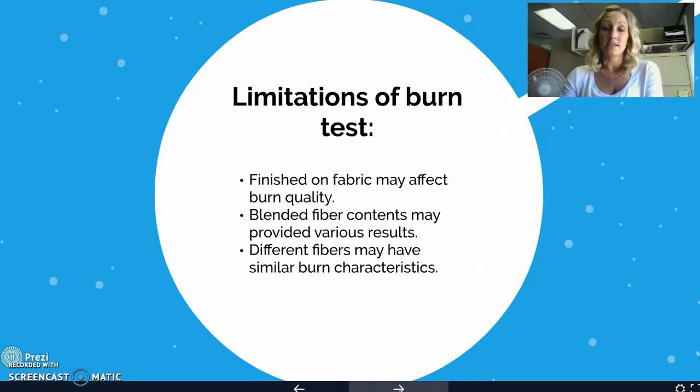Now, because of this, especially with the blended fabrics, make sure that you are testing the warp and the filling yarn separately, because with a blend, your warp is going to be different than your filling. So make sure that you are testing the different warp and filling yarns completely separately, and that will give you a better result with your burn test.